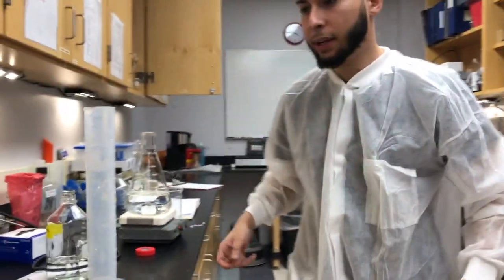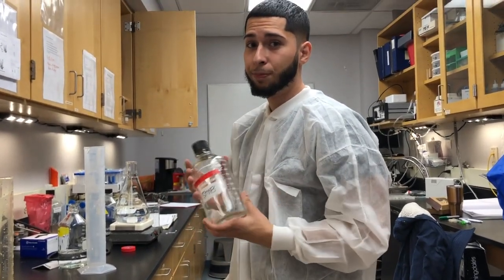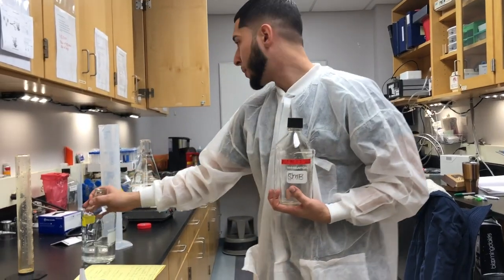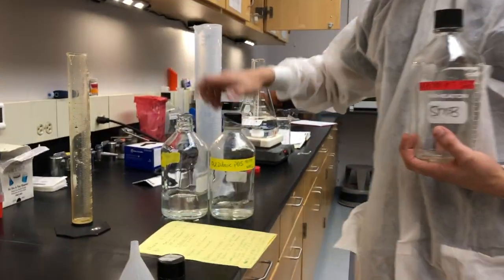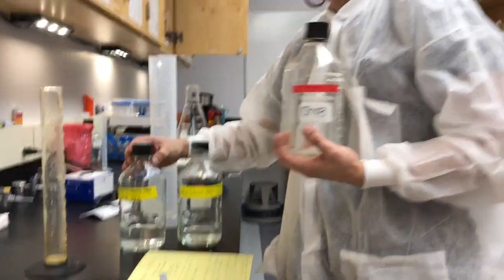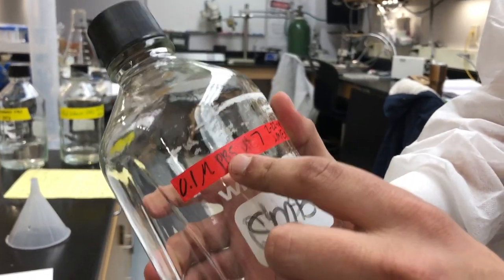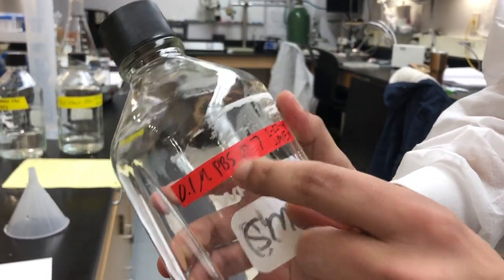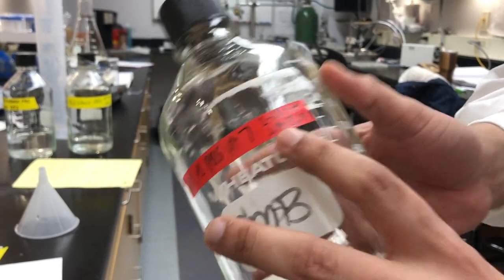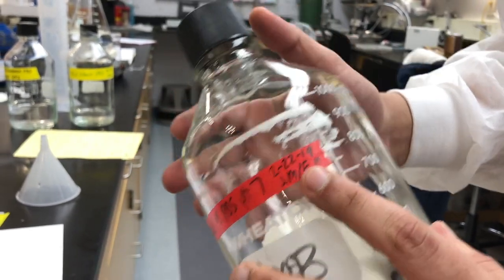Now while this is stirring, it's important to know about labeling your beaker. This is very important in the science community because a lot of these solutions look the same but can be very different in chemical properties, so you have to label everything. First, label the molarity — this is going to be 0.1 molar. Then what the solution is: 0.1 molar PBS. You'll also want to put the pH, the date you made it, and the names of the people who assisted in making the solution — that way, if anything goes wrong, they're coming after you.